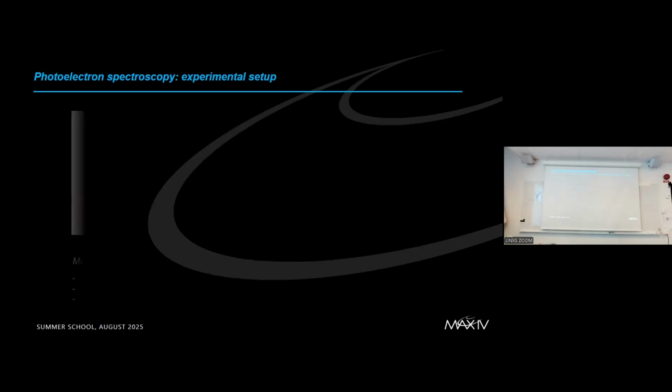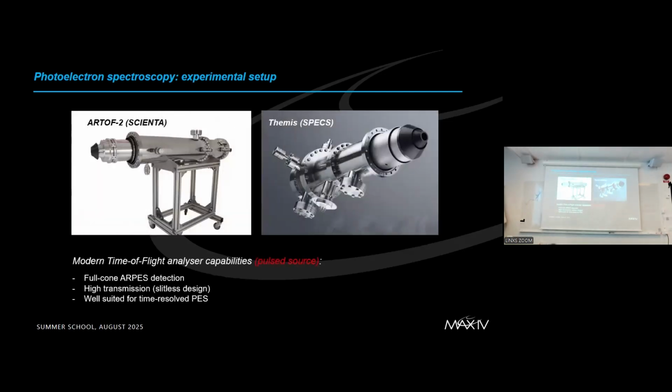Then, on top of that, you may find photoelectron spectrometers which are not hemispherical. This is a very special case. They are time-of-flight analyzers. They are using full cone ARPES detection, for example. So they are slitless. They don't have an entrance slit. So you have a complete ARPES map on the detector.